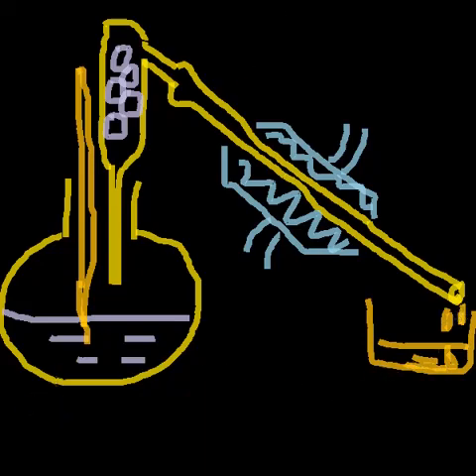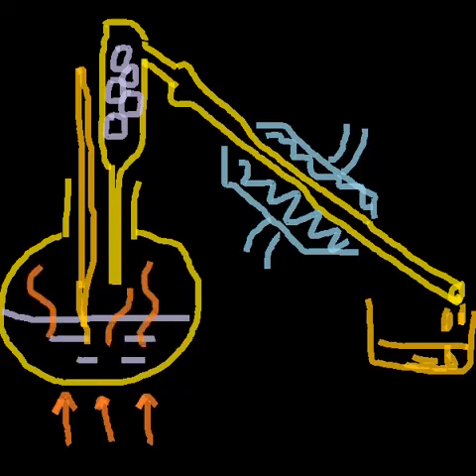Now the mixture is again heated just like the distillation process, and when we heat the mixture, the liquid which has a lower boiling point will start evaporating first.